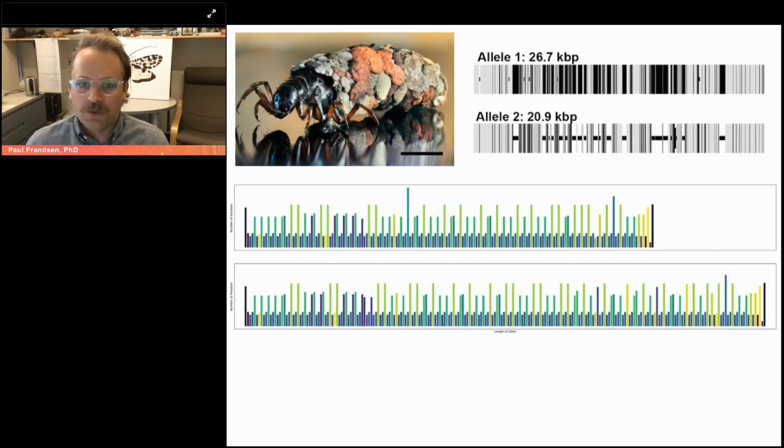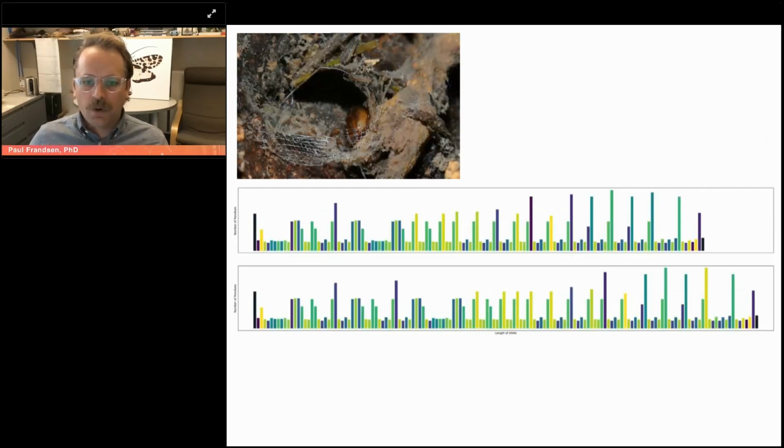And this is important for understanding this gene because we're trying to link the properties of this gene exactly with its phenotype. And to do this appropriately, we need to really understand the variation in the protein. And so these are just schematics that show the repetitive regions of the gene repeated over and over again. You can see that one allele is much shorter than the other. And so why is this important?